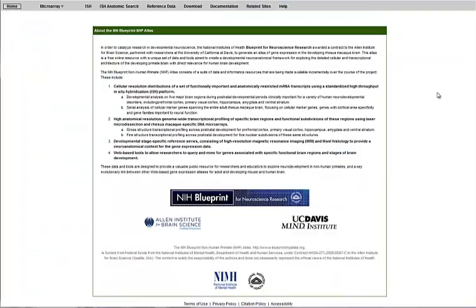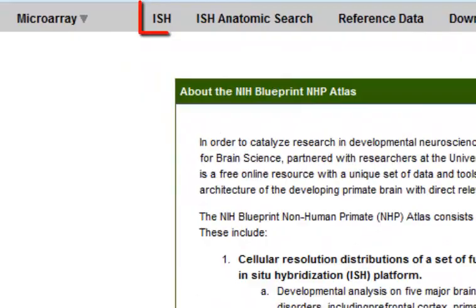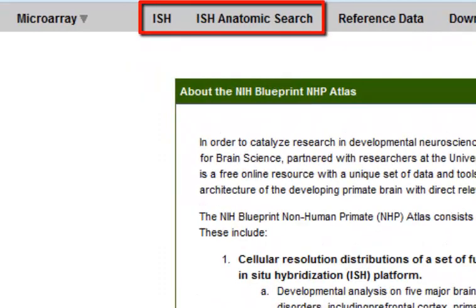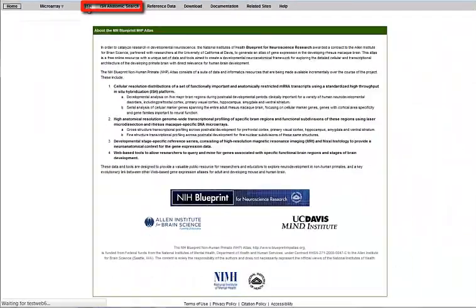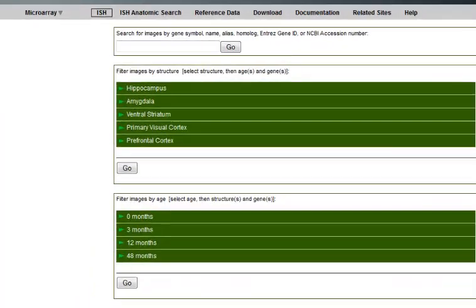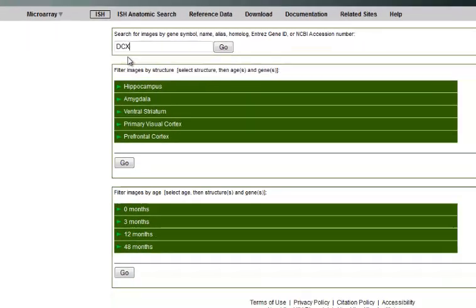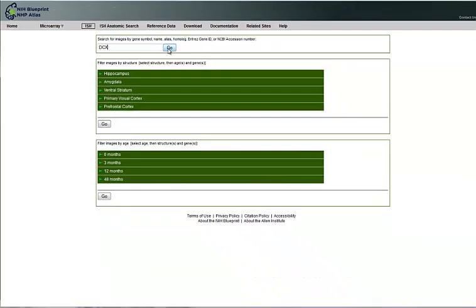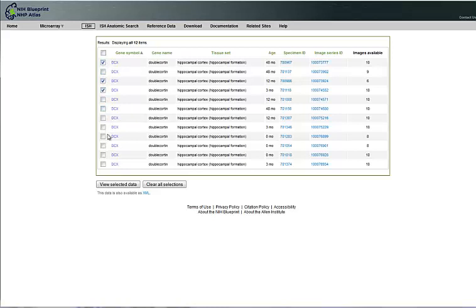While there are several distinct data modalities in this atlas, we will be focusing on searching and navigating the in-situ hybridization data. For a simple gene search, type your gene name or abbreviation into the text box and click Go. This dataset includes at least three replicates at each stage. I'll choose one experiment at each developmental stage, and then click View Selected Data.